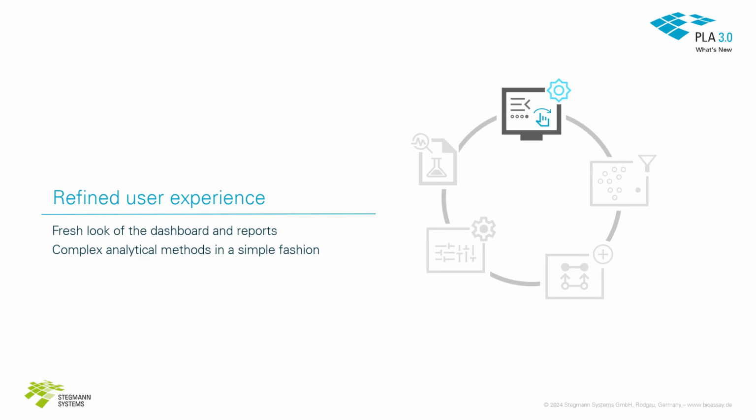Let's now look at the new features of the Biological Assay Package version 27. First of all, the dashboard and reports received a fresh look, while the configuration of analytical methods is more intuitive than ever before.